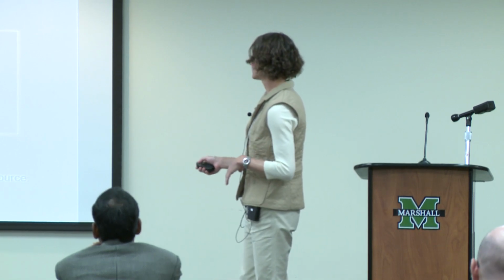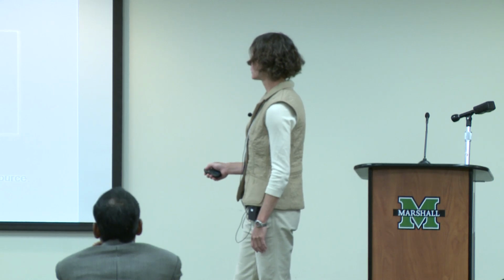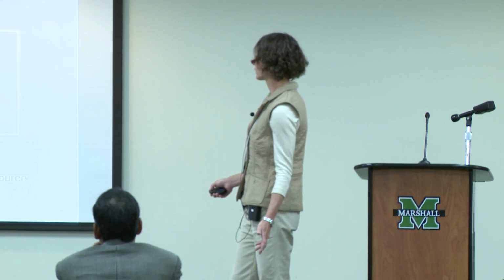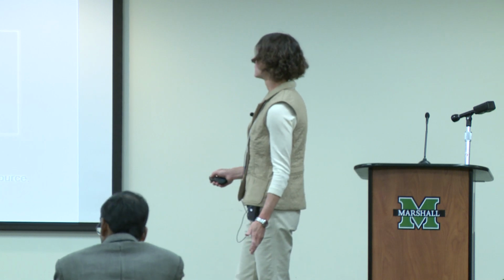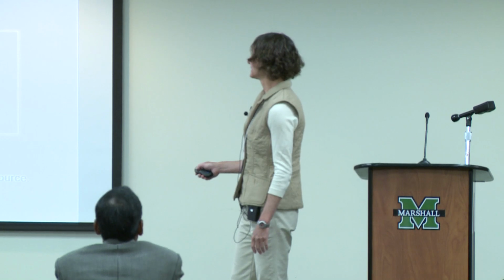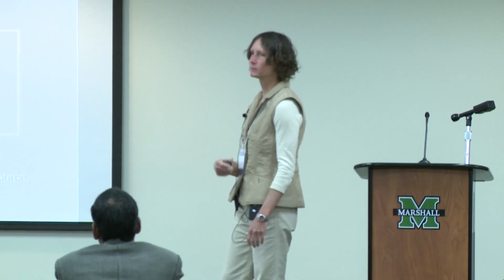So I think, conceptually, de novo assembly is very simple. You really want to create a contig, which is just short for contiguous, and it is a set of overlapping DNA fragments. And then, if you can take all 50 billion of your bases that are represented in these short fragments and create these contigs, you will ultimately get the sequence of your entire organism.